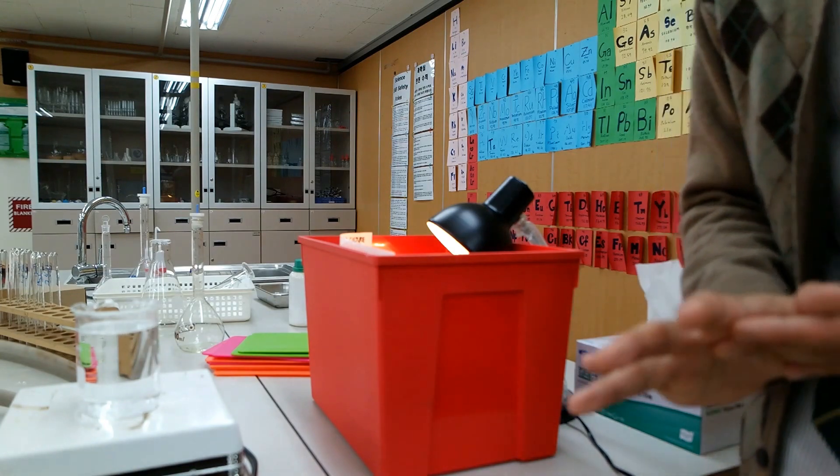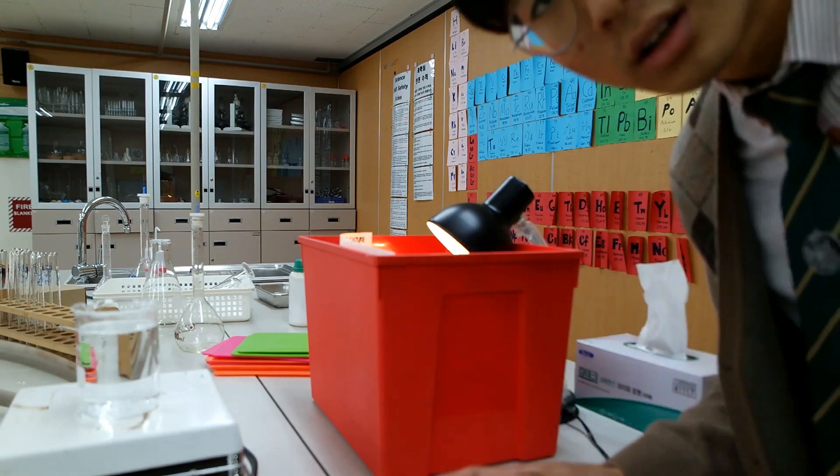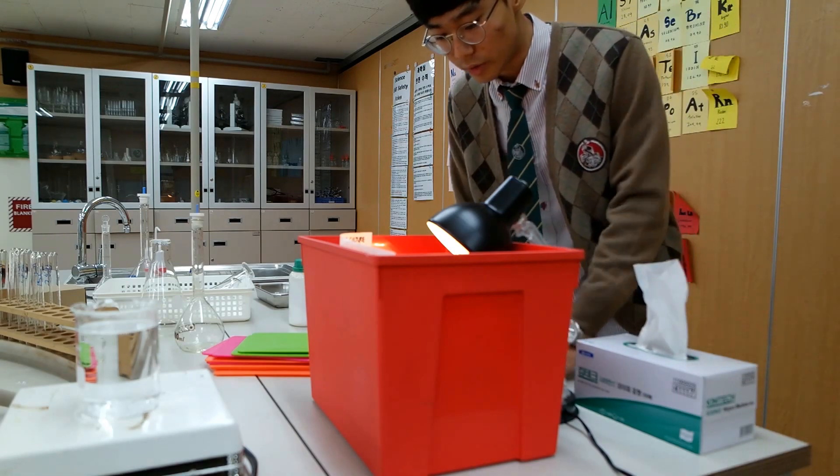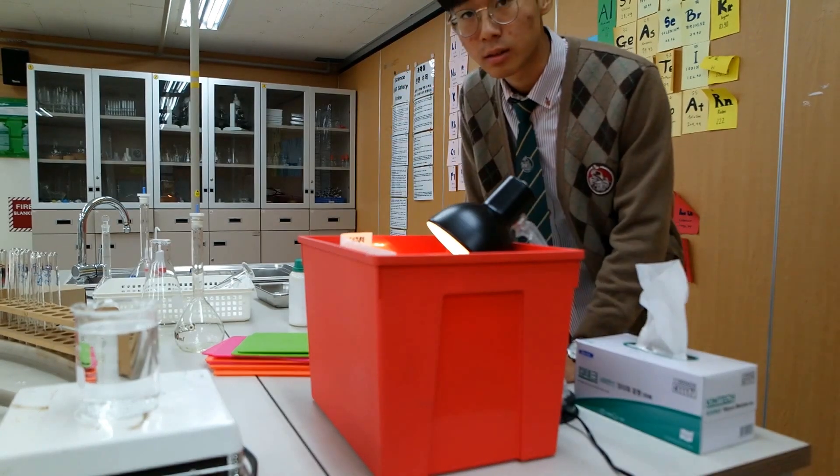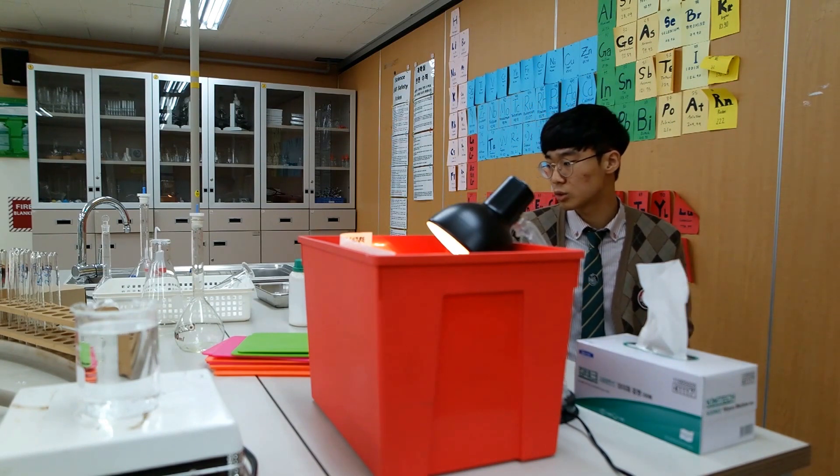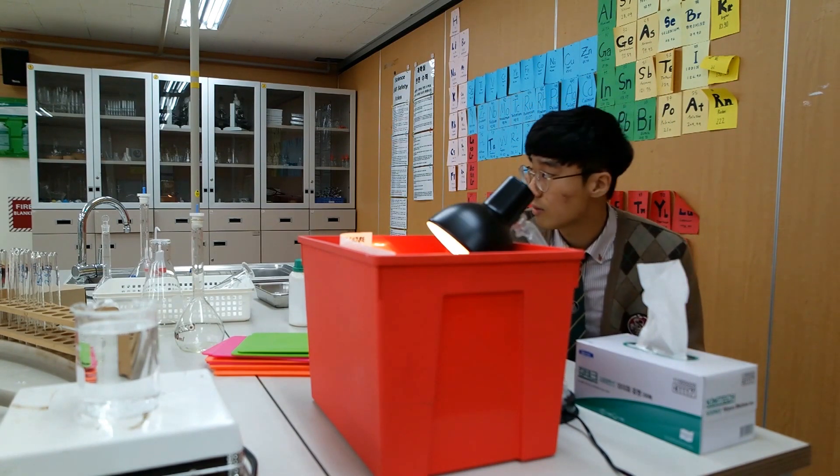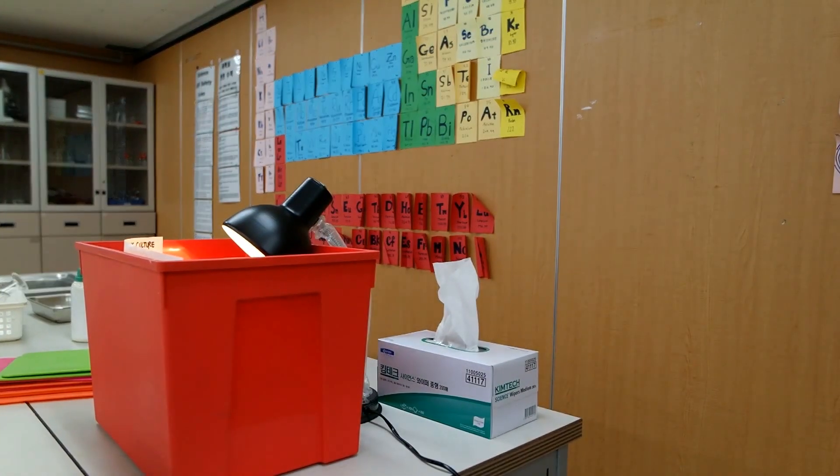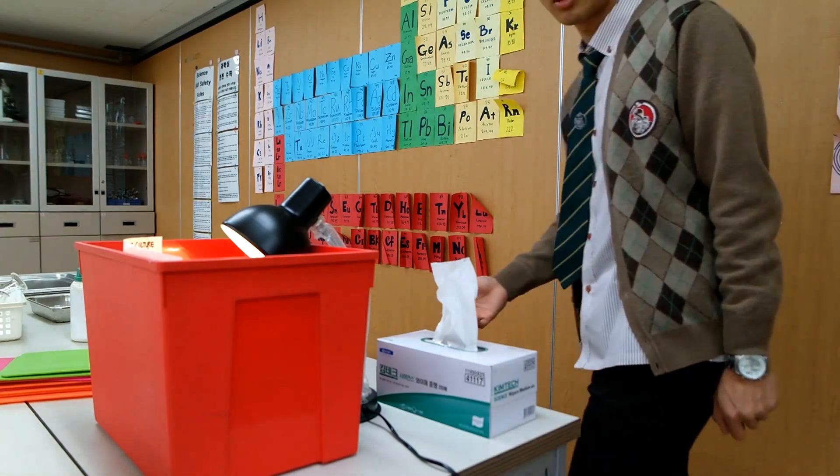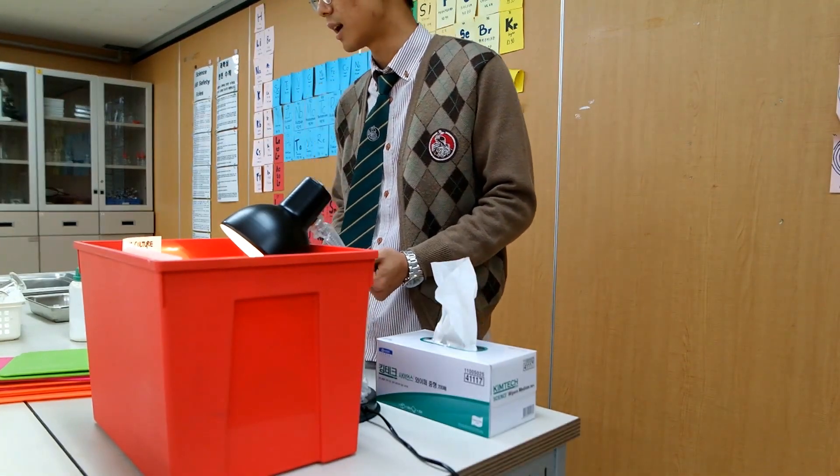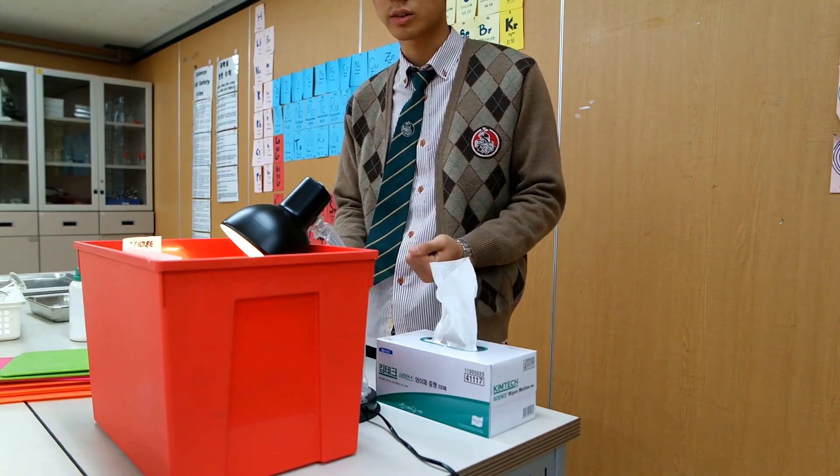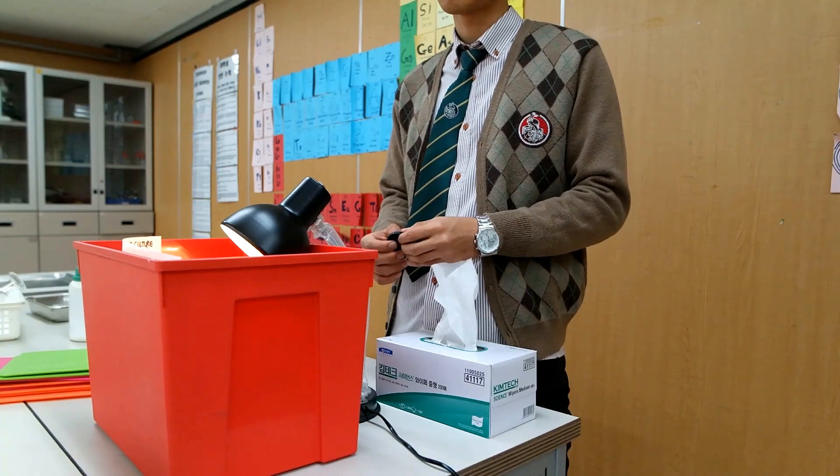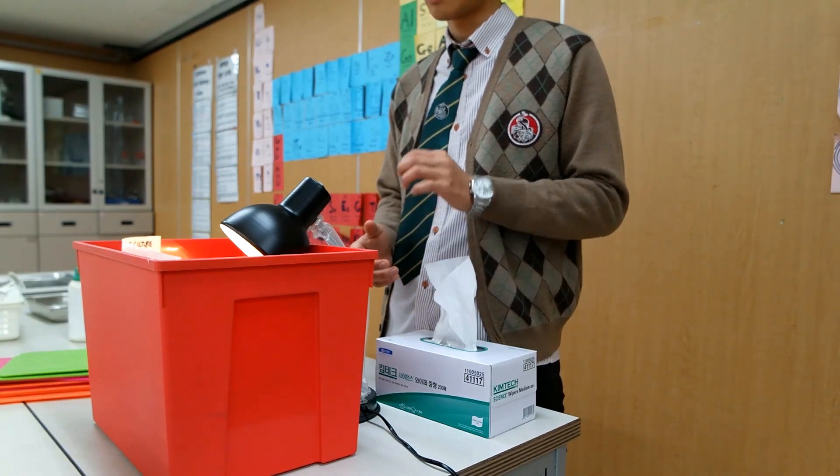To jump to the conclusion, I haven't found an actual way to calculate if my algae is growing or not. I just have to rely on my beliefs and my visual senses. However, I've talked to my bio teacher and he said to use light. So I'm trying to get a device to record the optical density. That would take some time.